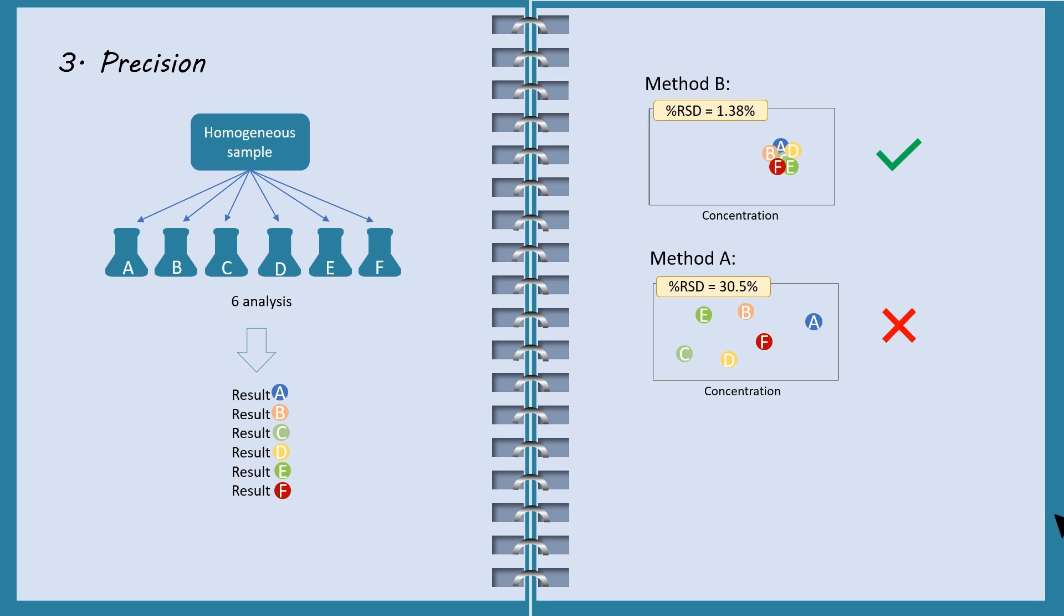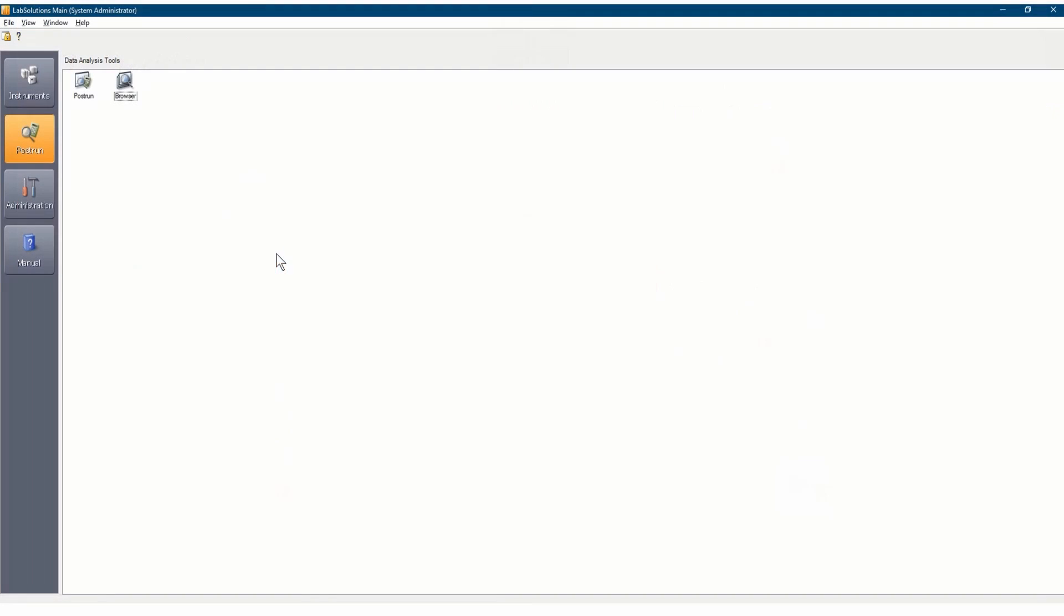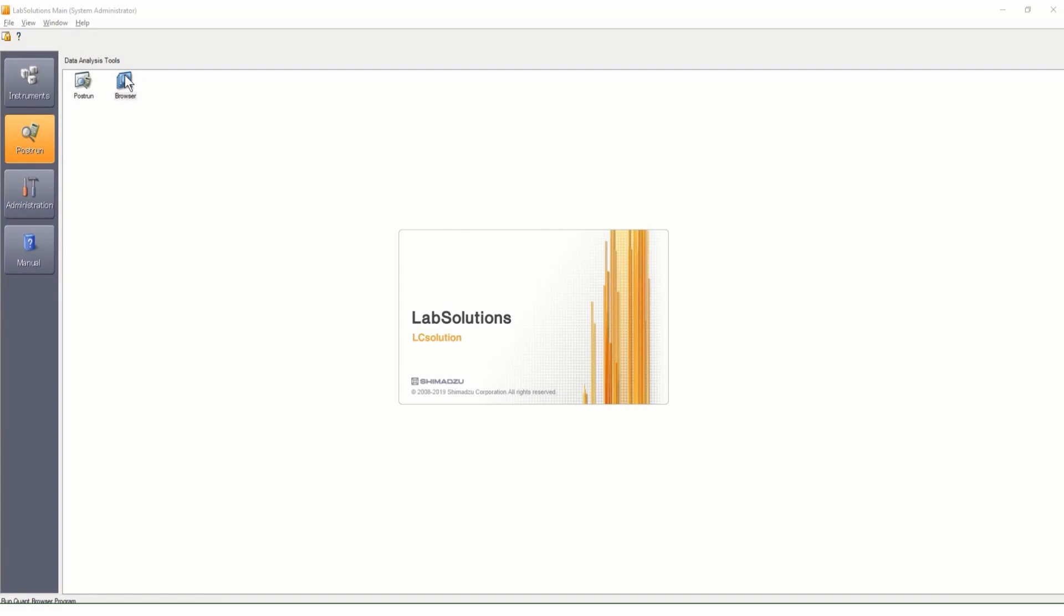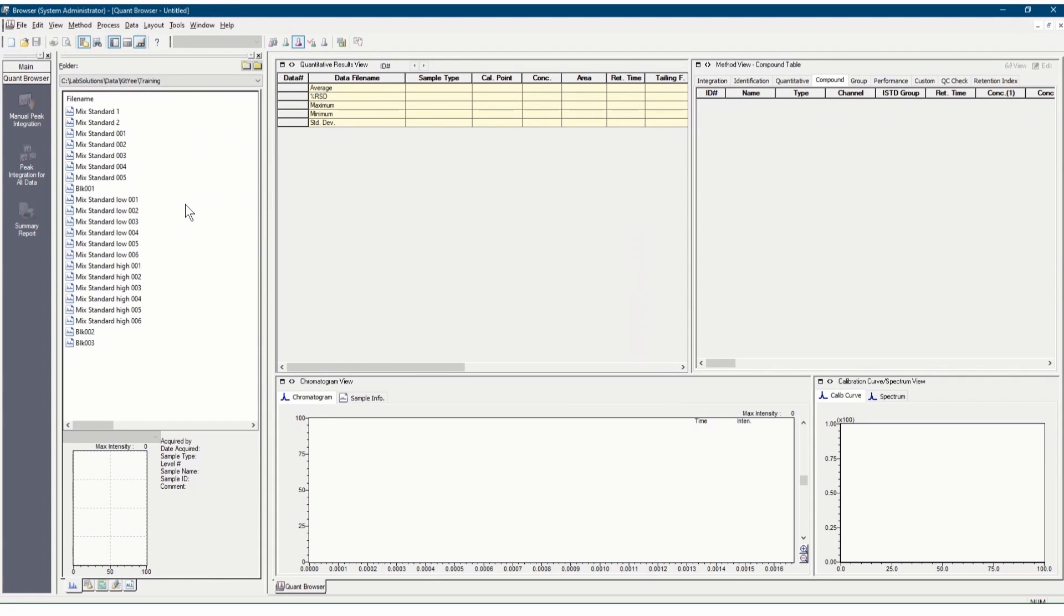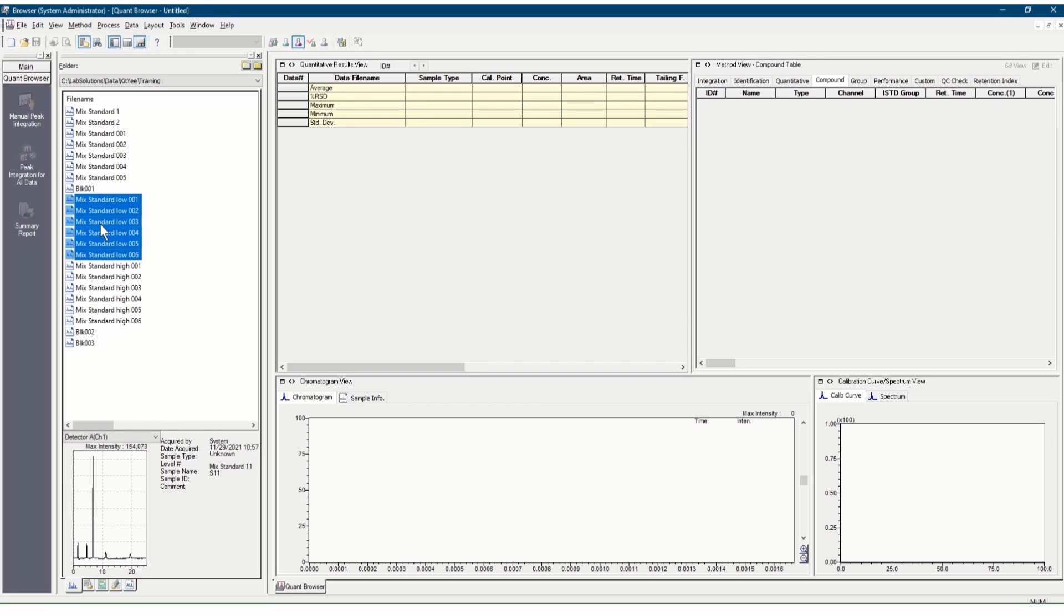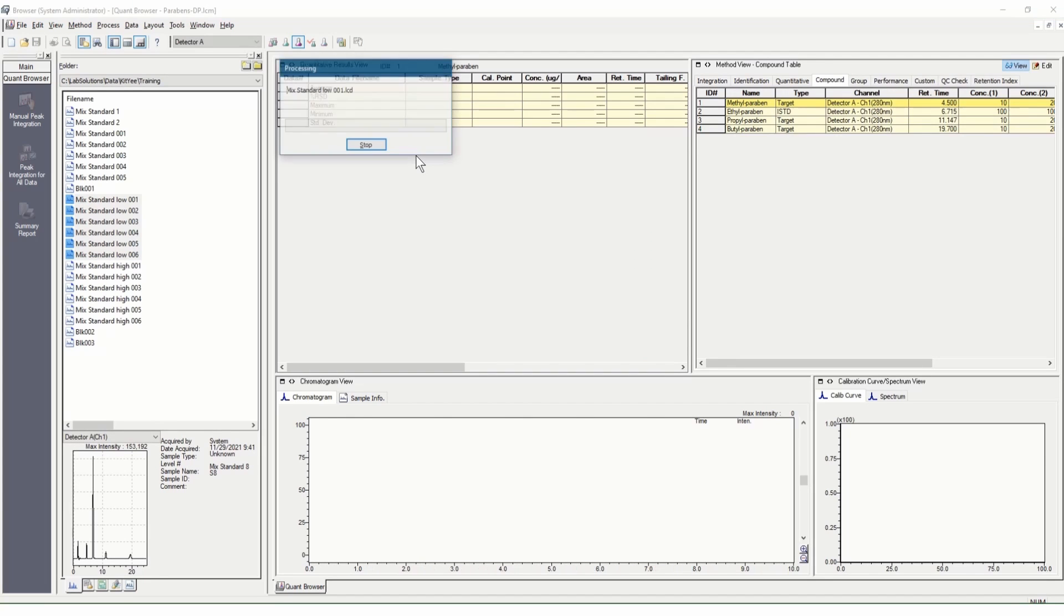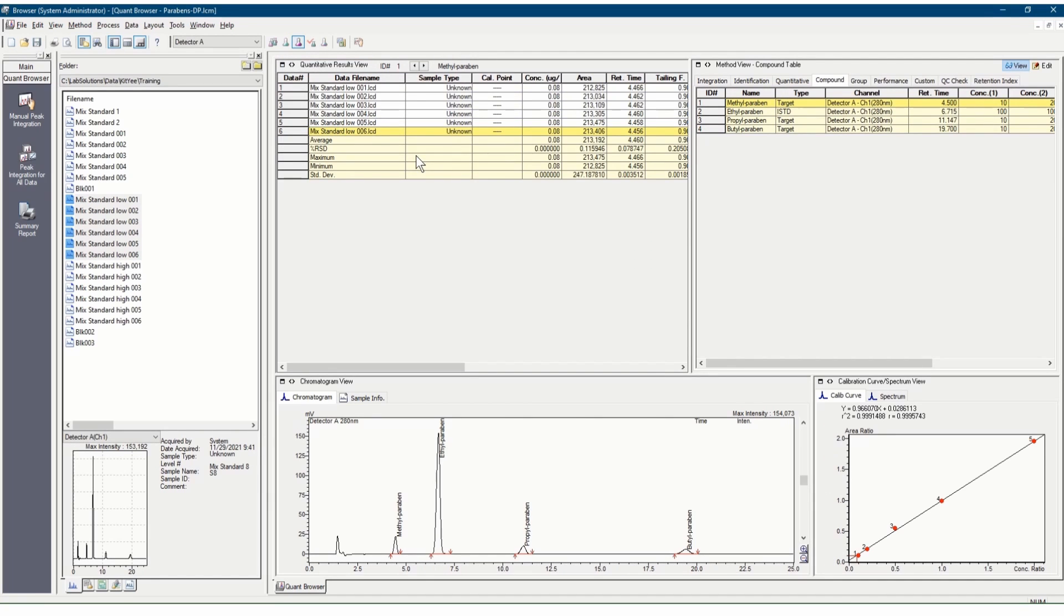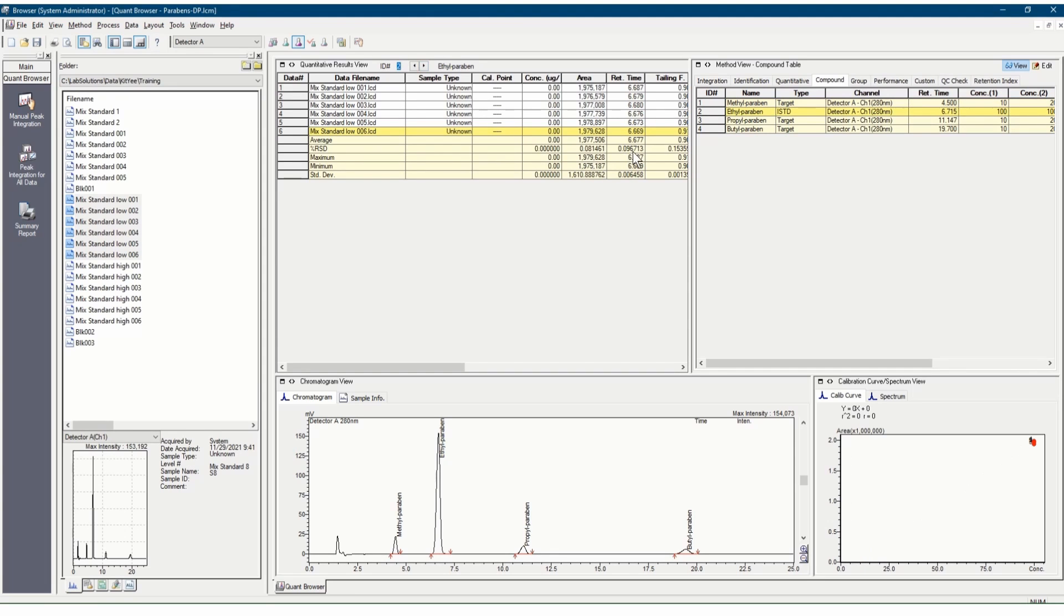Next, let's check the RSD value in LabSolutions software. To check percentage RSD, double-click browser icon. Open data files in quantitative results view. The calculated percentage RSD of each parameter, such as area and concentration, will be displayed on the bottom of the table.